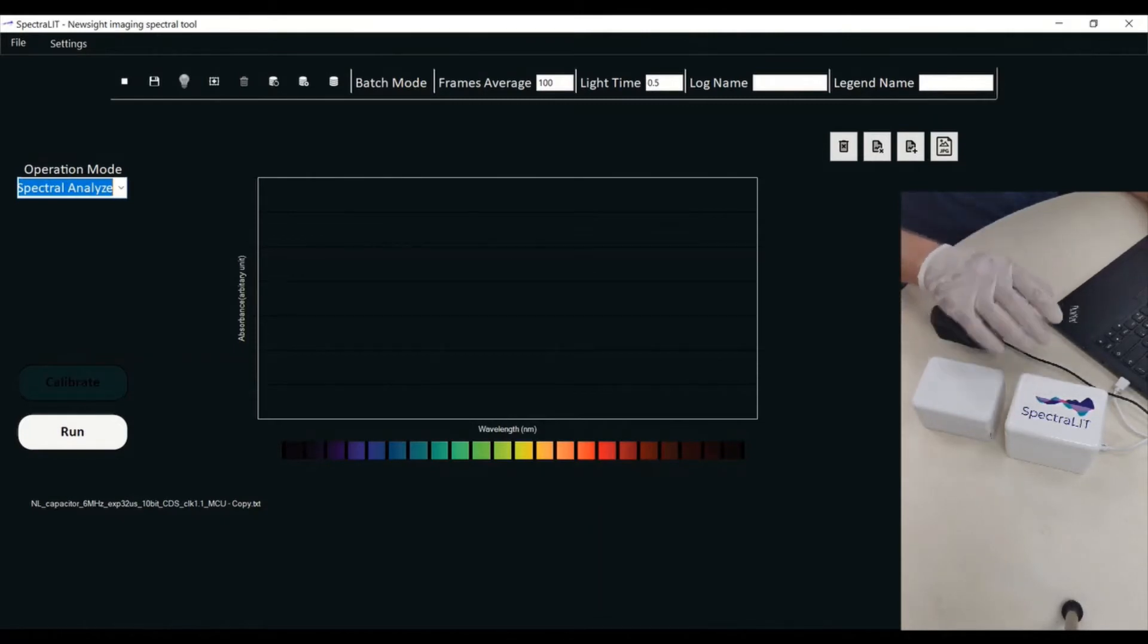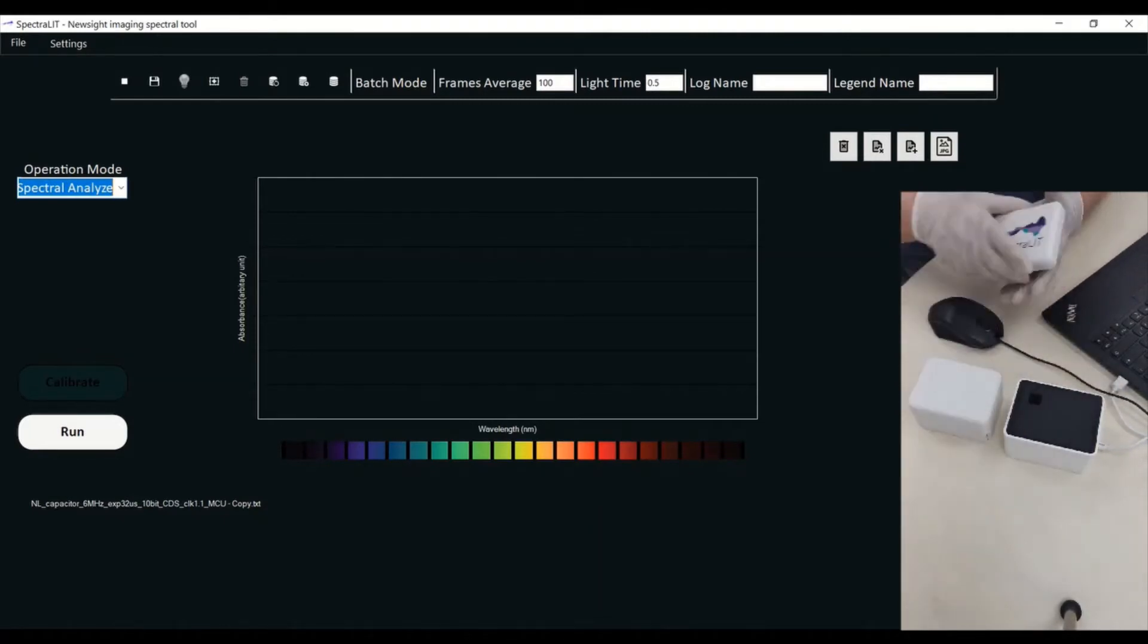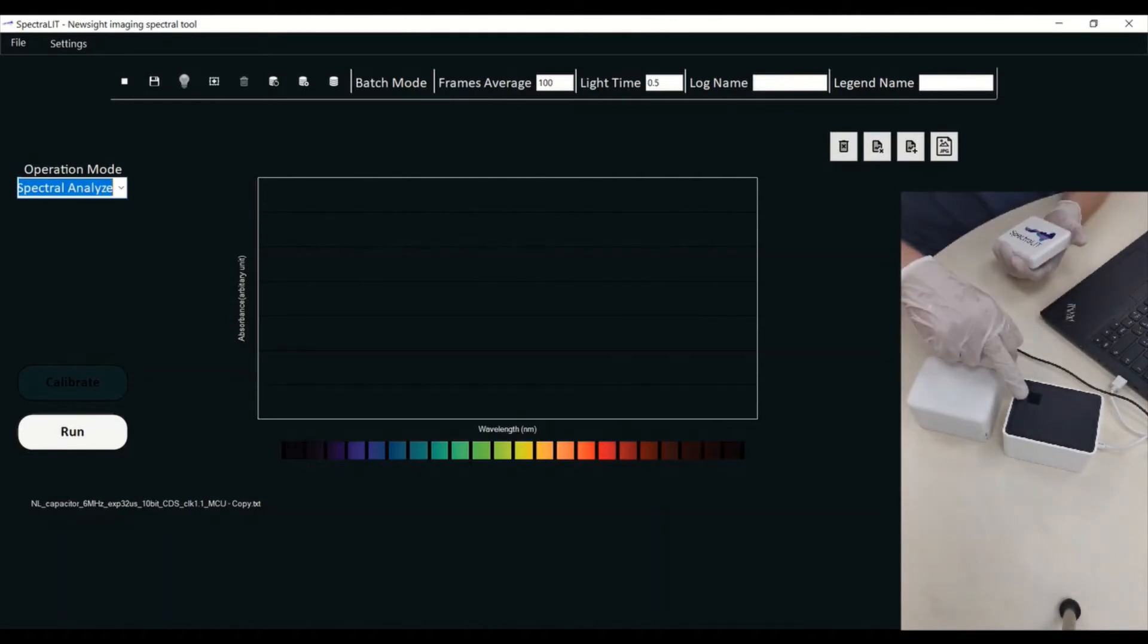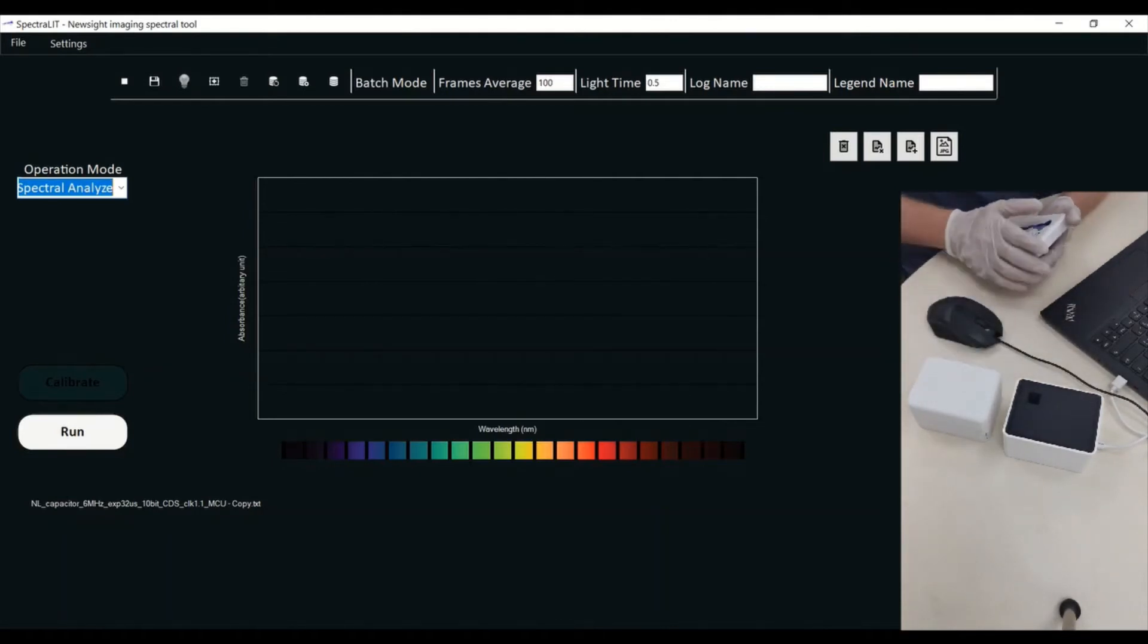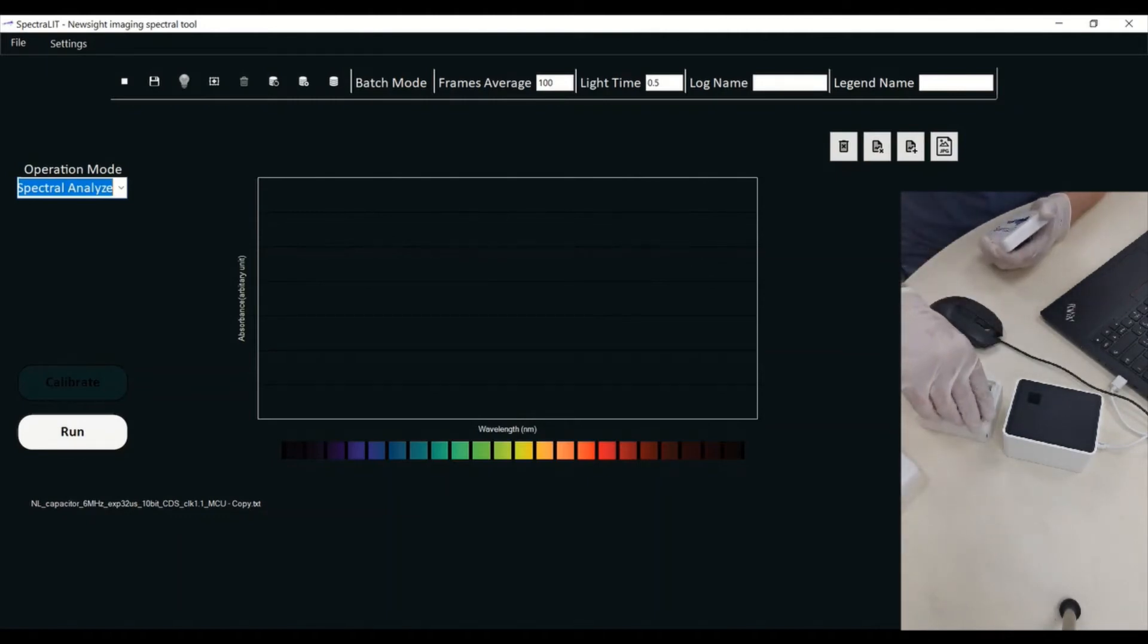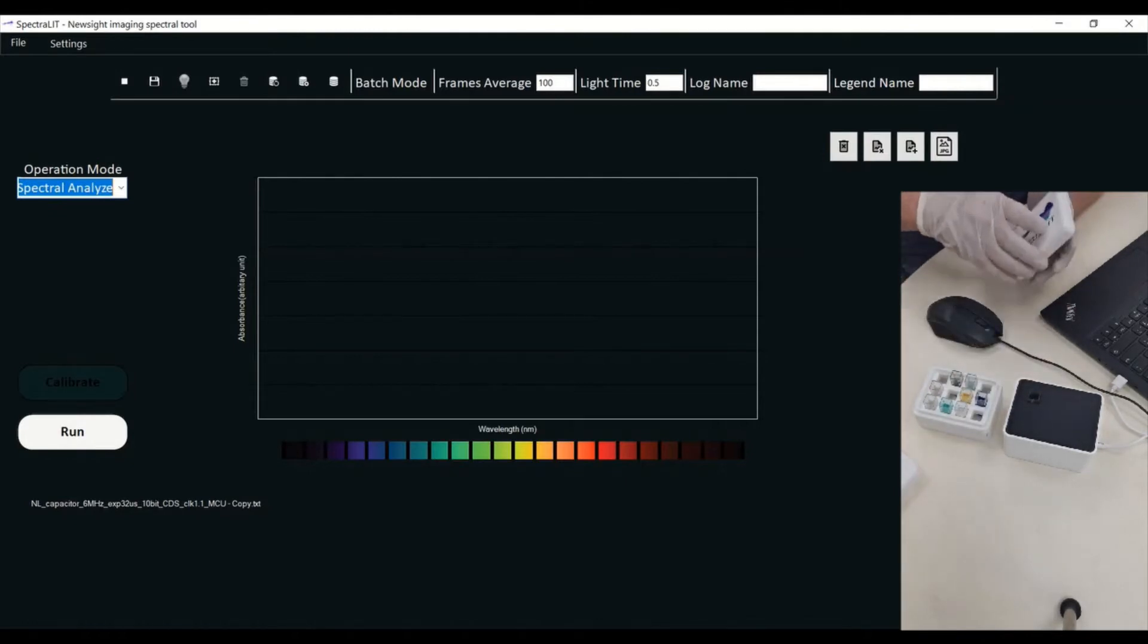We have here the Spectralit unit. The Spectralit unit has a lid. You have inside a special bay that you can put disposable cuvettes or any other cuvettes with the substance that you want to check.